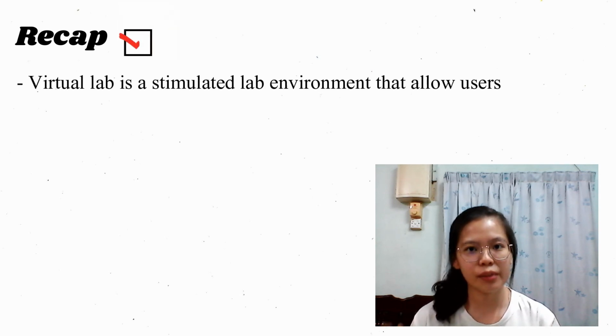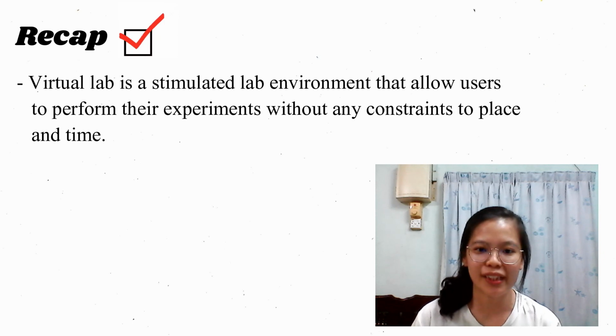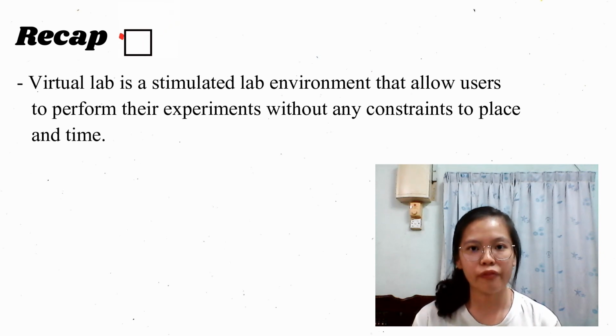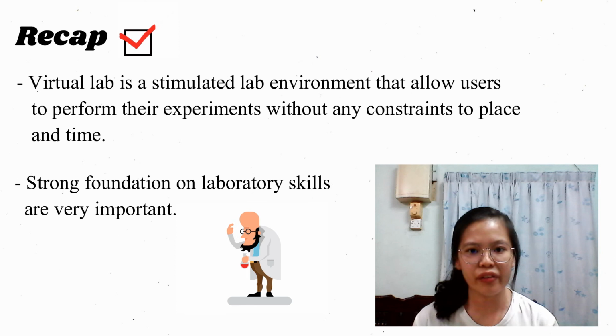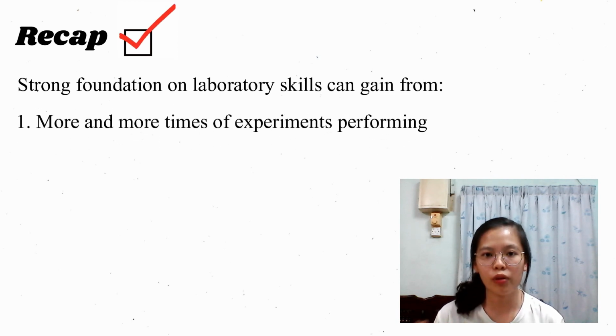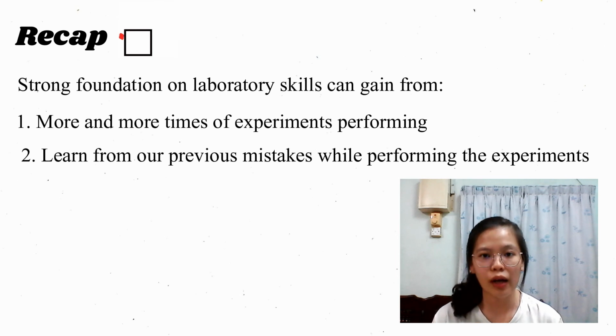Now, let's recap what has been presented by my teammates. Now, we know that a virtual lab is a simulated lab environment that allows users to perform their experiments without any constraint on place and time. All of us are undergraduates from the Faculty of Resource Science and Technology, and a strong foundation in laboratory skills is very important for our future study. A strong foundation in laboratory skills can be gained from performing experiments more and more times, or by learning from our mistakes while performing our experiments.